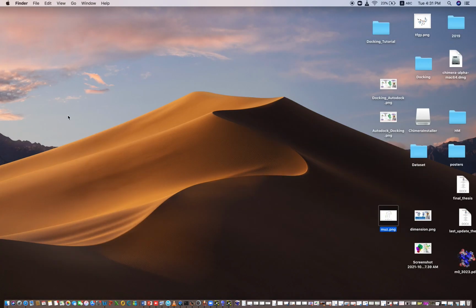This was all from my side. By watching this video, you will be able to know how you can analyze the results and generate high quality pictures, which you may use for publication or for your thesis.